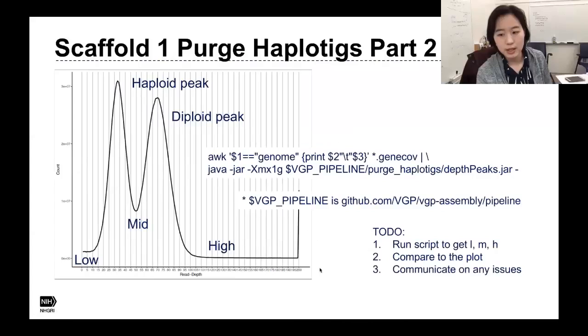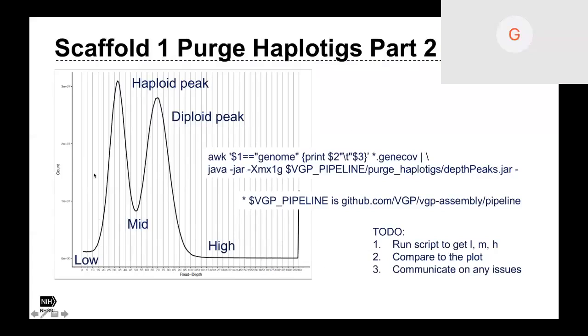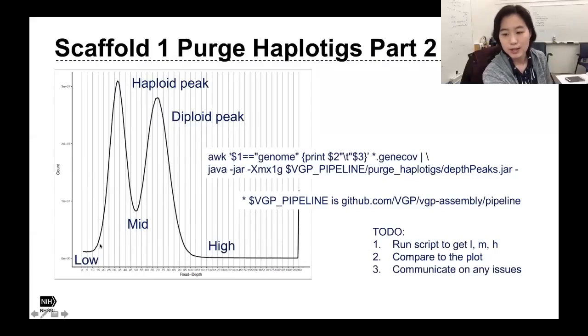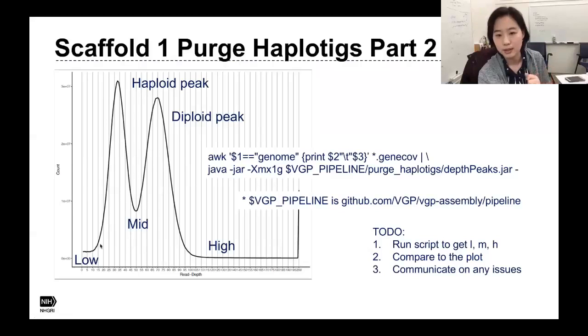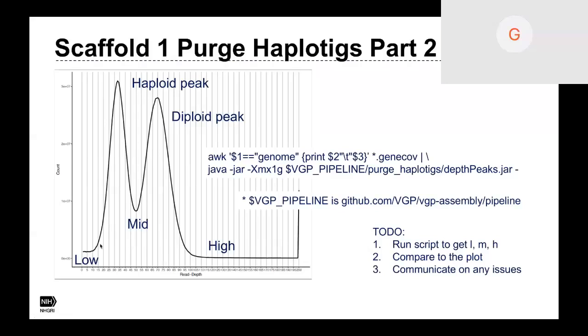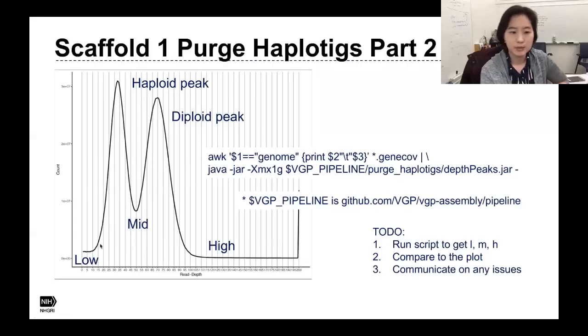It runs Minimap2 internally, in the latest Purge Haplotigs. It used to run LASTZ inside, but then it switched to Minimap2 to identify, using the contigs having the haploid peak coverage as a query. It aligns back to the rest of the contigs to find the pairing haplotype. And then it gets rid of the smaller one. So it's essentially a way to identify the contigs that are putatively unique in the first place. Yes, I think so, yes. Okay. Thank you.